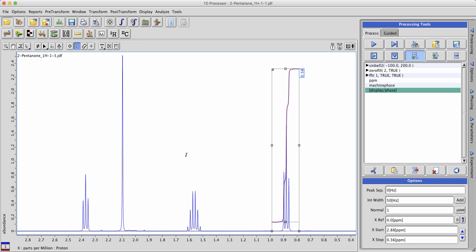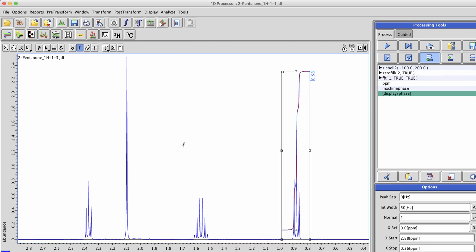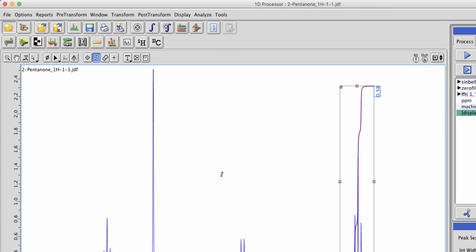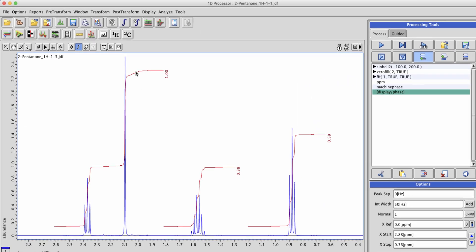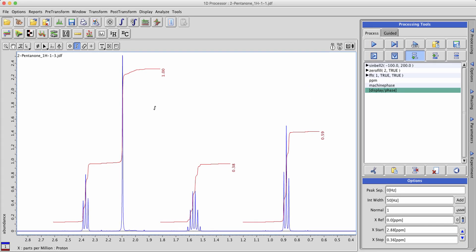Once you go through and make as many integral regions as you would like in this method, or if you have a lot of peaks and would like to mass integrate the entire spectrum, click the auto integrate button. A series of integrals will be drawn due to a few factors that we'll cover in a later tutorial.